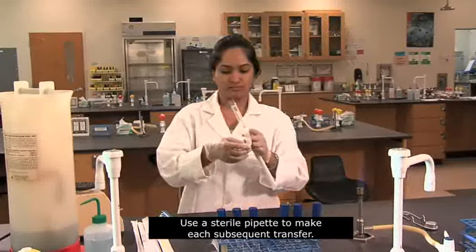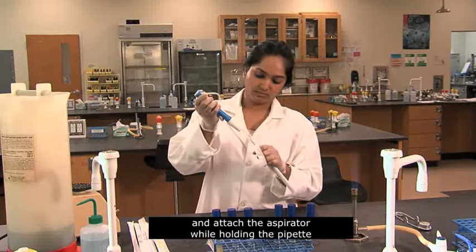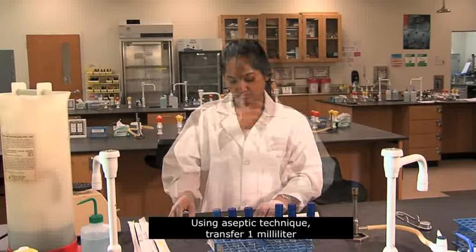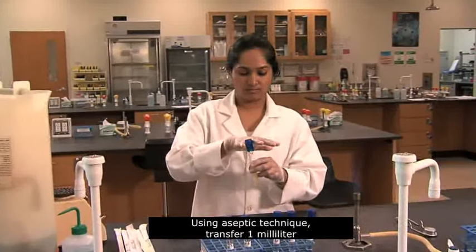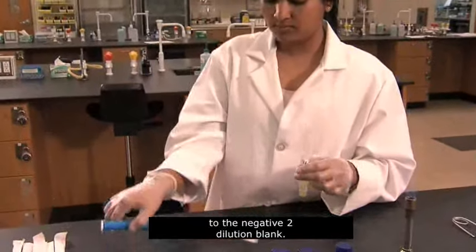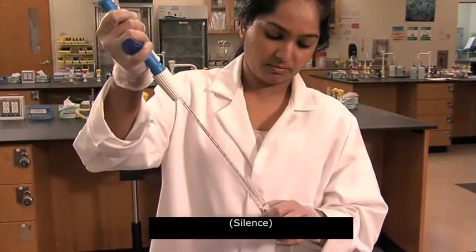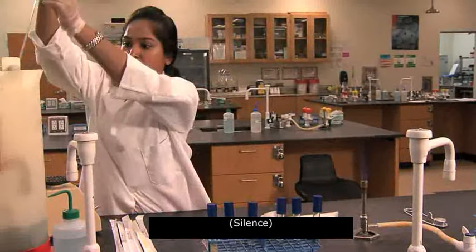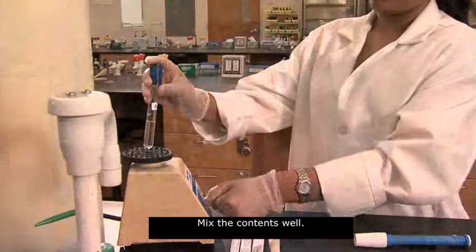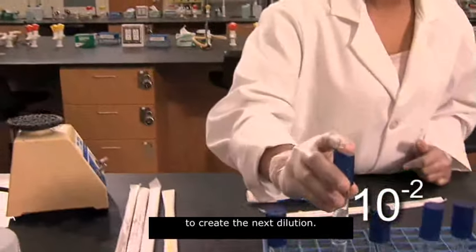Use a sterile pipette to make each subsequent transfer. Open the pipette wrapper at the top and attach the aspirator while holding the pipette by its wrapper. Do not touch the pipette with your hands. Using aseptic technique, transfer 1 milliliter from the 10 to the negative 1 dilution to the 10 to the negative 2 dilution blank. Mix the contents well. This 10 to the negative 2 dilution can now be used to create the next dilution.